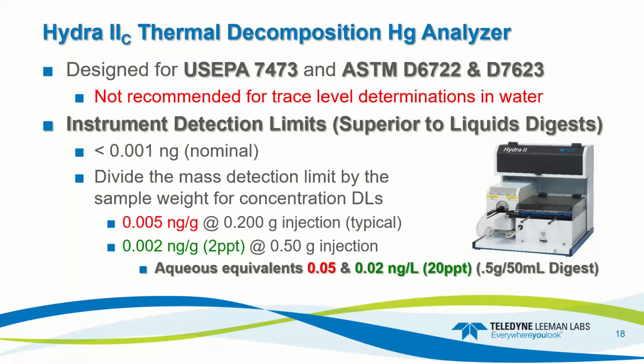As I just mentioned, it's really designed for solid samples. It's not recommended for trace level determinations in water. If you need to run trace levels for water samples, there are other great options from Teledyne Leeman Labs that were designed specifically for this, but I wouldn't recommend the Hydra IIC for a sample load that's mainly aqueous.